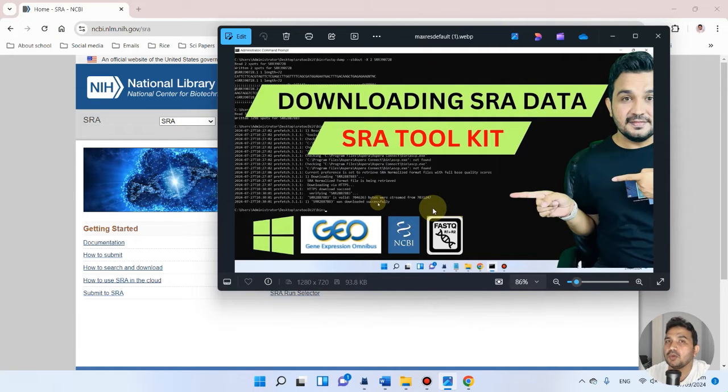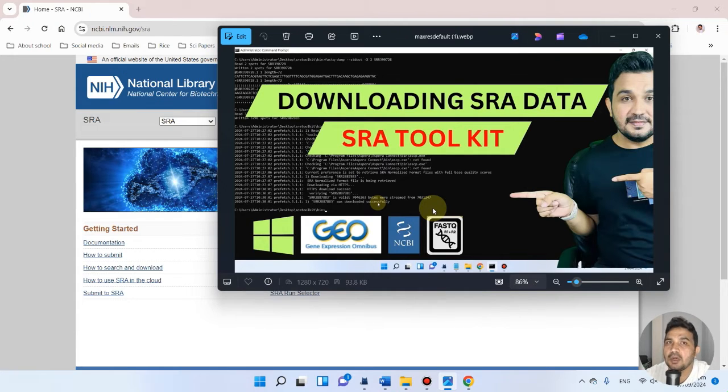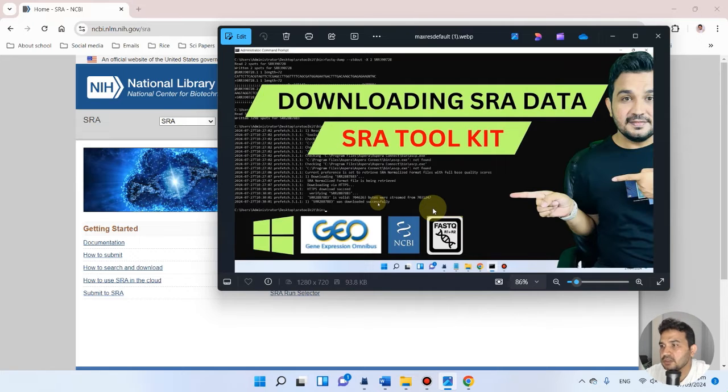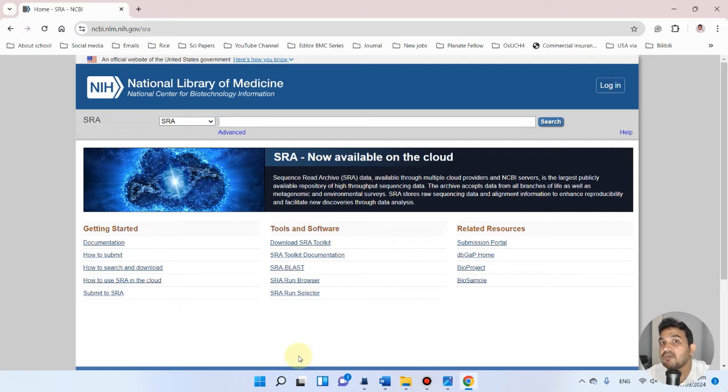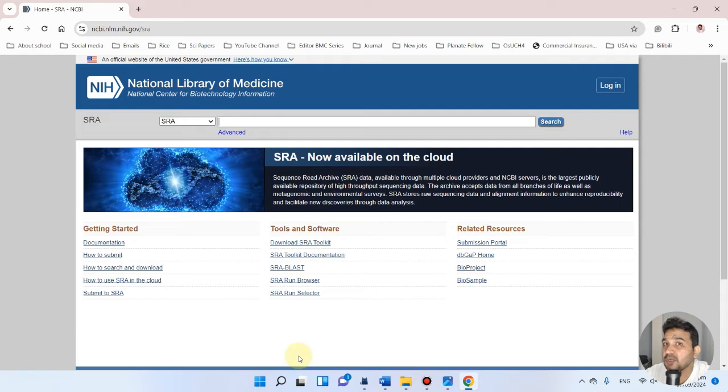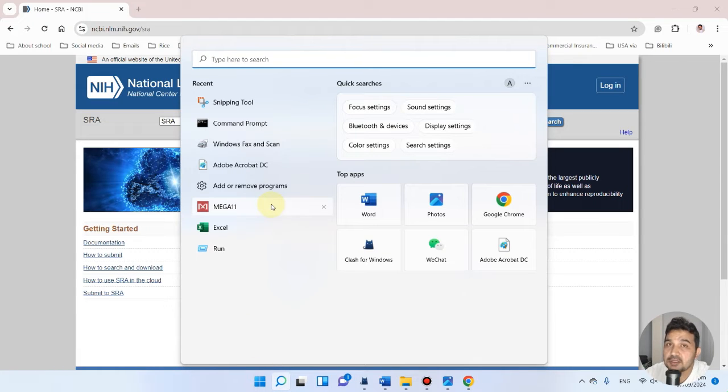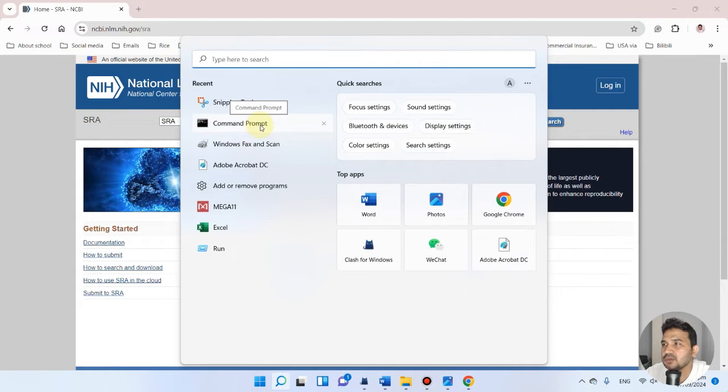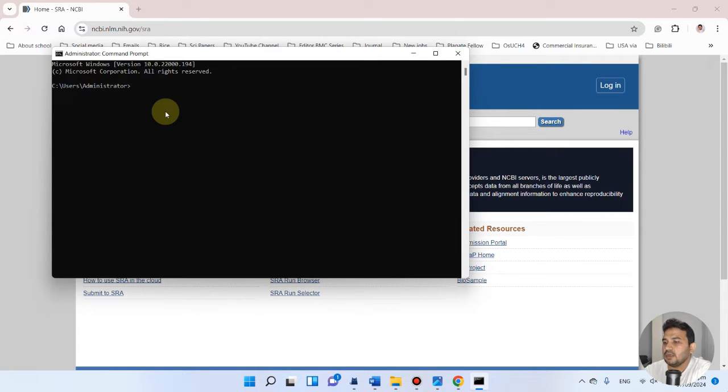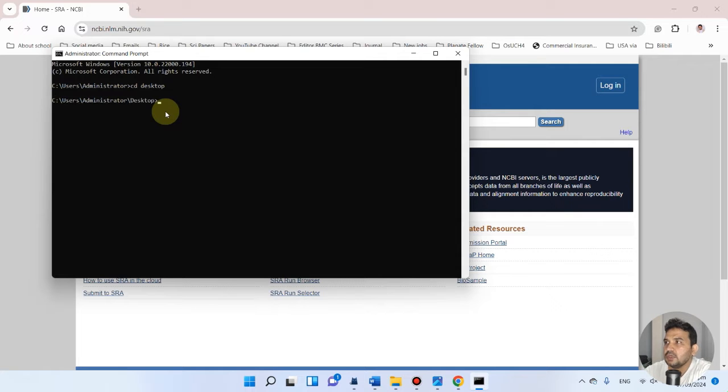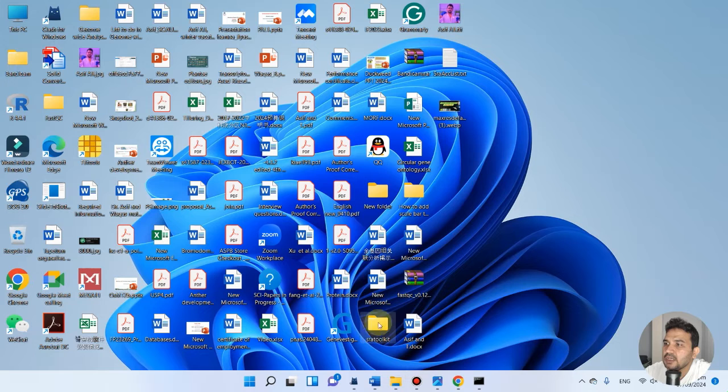But before that, let me access the bin folder that we already accessed in our previous video. If you haven't watched that previous video, I recommend you watch it first. Since we've already installed SRA Toolkit, we can simply go to the command prompt and change directory to Desktop, because we placed the SRA Toolkit on our desktop.